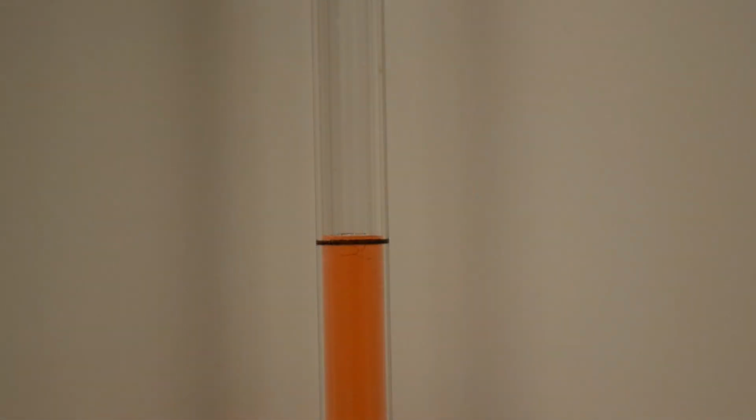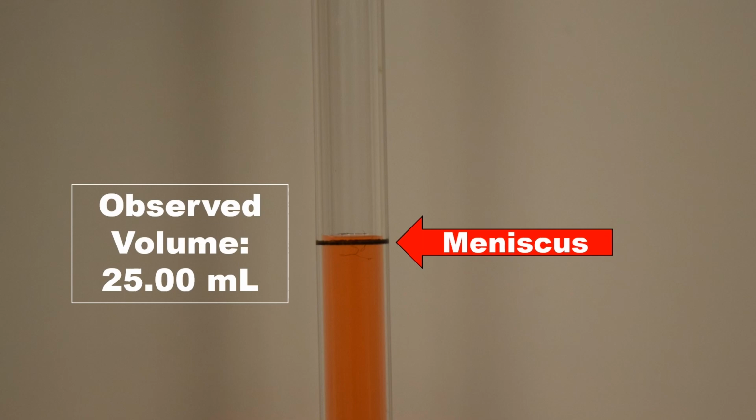Some pipets have multiple graduations. The pipets we'll use only have one. In this example, the observed volume will be 25.00 milliliters. Now let's get back to the experiment.